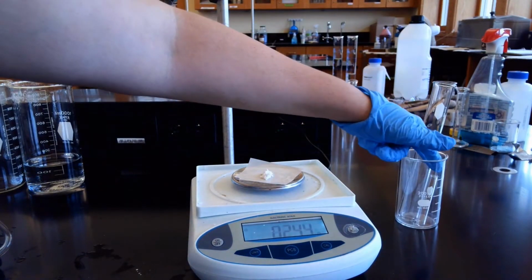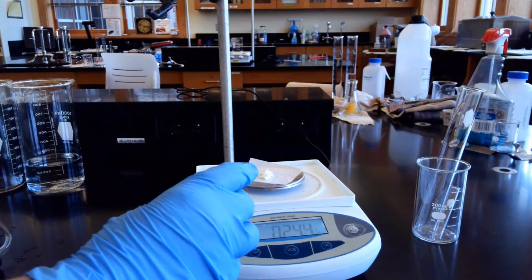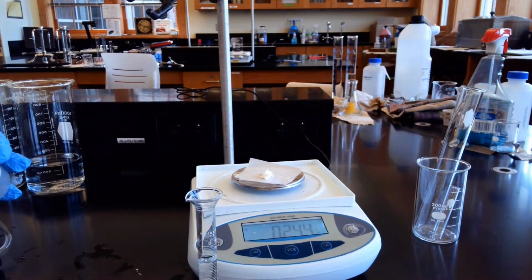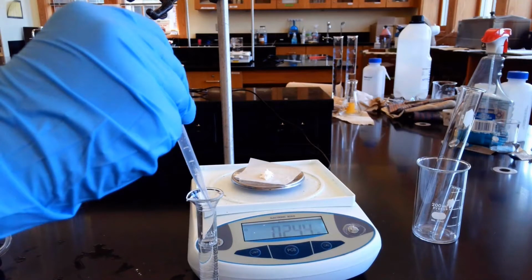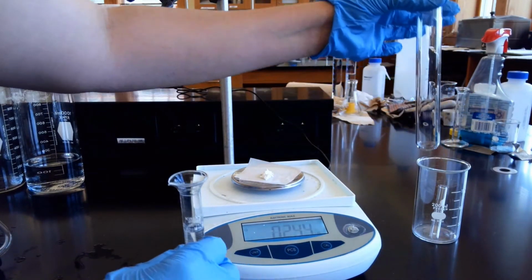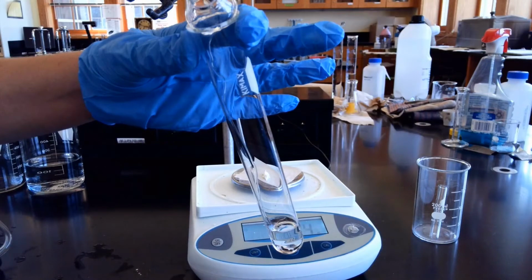We're going to get it into this little tiny one over here, and then we're also going to add our HCl. So let's do our HCl first. We have our 10 ml graduated cylinder, our 3 molar HCl. We're going to go up to 10 mL. Okay, there we are at 10. We're going to take those 10 mL and put them inside our large test tube. There we are.